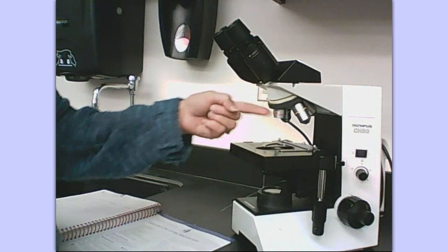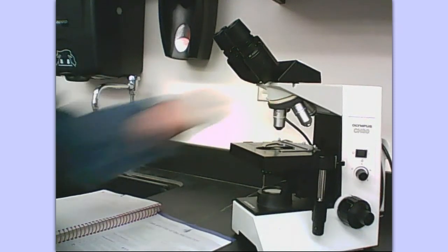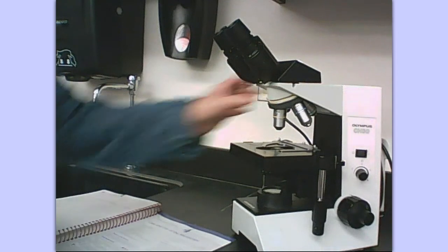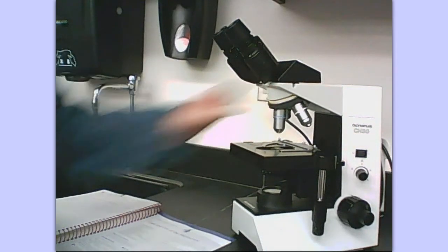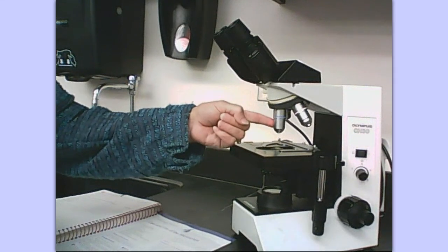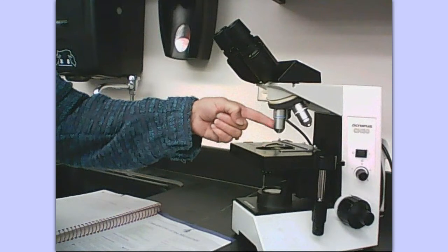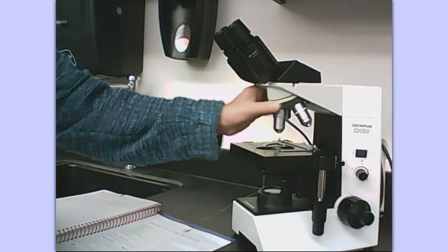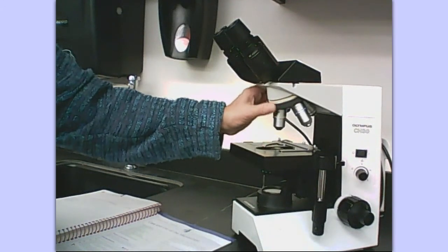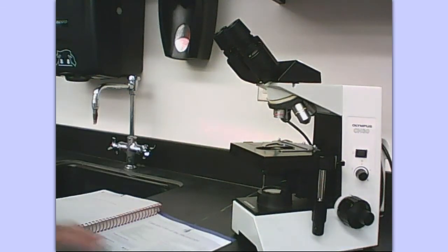Let's go through those objectives again: the scanning objective, the low power objective, high power — sometimes called high dry because we're not using any oil with it — and then oil immersion, but you don't have to know that one because we never use it in the A&P lab.